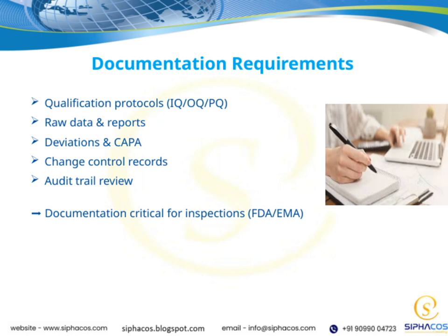All of these documentation elements are not just best practices. They are critical for inspections by regulatory agencies like the FDA and EMA. Well-maintained, comprehensive documentation demonstrates our commitment to quality and compliance, and it's often what inspectors focus on to verify that we're operating within regulatory standards.